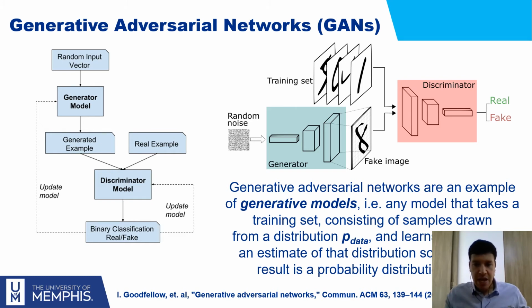So that's the main idea. It is a competitive training because we need to train the generator to generate images, but we also need to train the discriminator to not fail at discriminating between real examples and generated examples of the signals.